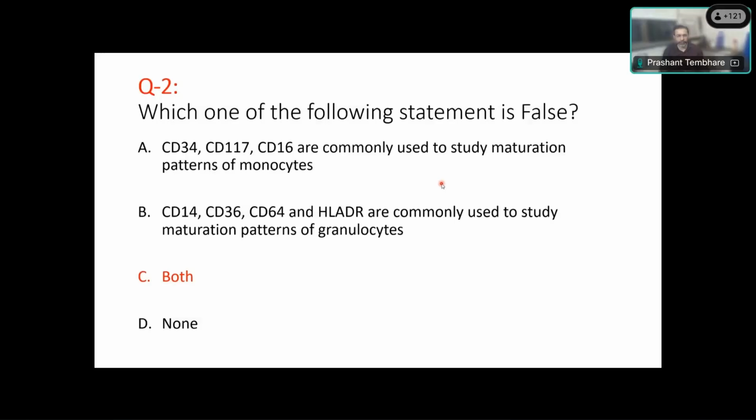So what genetic or proteomic studies do you have related to the above validation of patterns or ontogeny studies? Okay, some patterns are typical of some genetic abnormalities, but not all proteins.